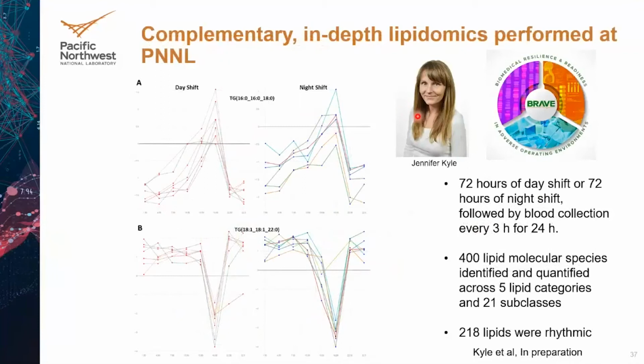Project was led by Jennifer Kyle here, looking at the same exact samples, and sure enough, we can replicate the cycling behavior of lipids with time, which gives us confidence that we're able to tease out these differences using a conventional lipidomics analysis.